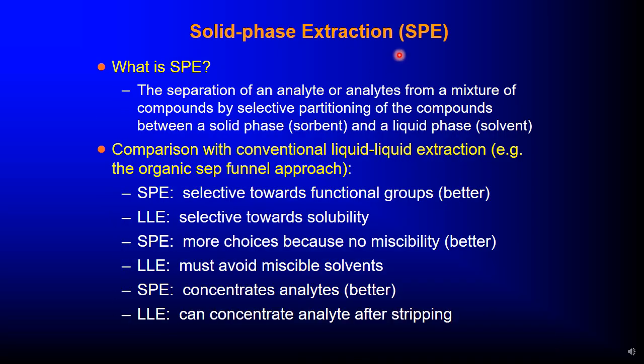Then solid phase extraction. What is solid phase extraction? The separation of an analyte or analytes from a mixture of compounds by selective partitioning of the compounds between a solid phase and a liquid phase.